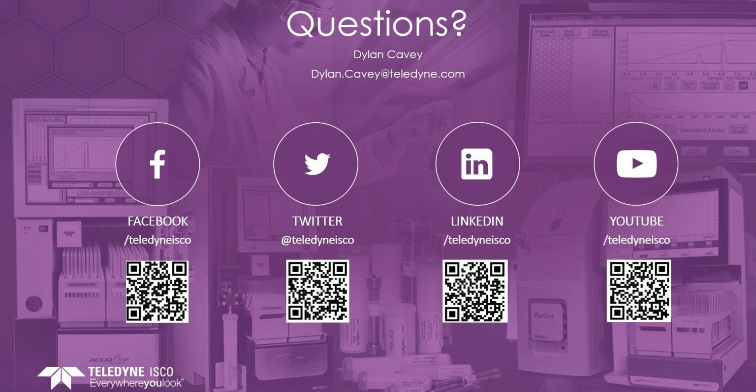We look at that solvent selection chart. We used an example in the webinar. Look at changing some of the groups of your solvent systems, and that's just going to change the properties of the solvents, and that's going to allow you to achieve different separations. Look at your stationary phase as well. If you're looking at reverse phase, you can change from a C18 to a C8 or C18AQ. You can even use an amine in reverse phase. Similarly, if you're using normal phase, look at the aluminas, look at the amines as well. So change those stationary phases and/or mobile phases.